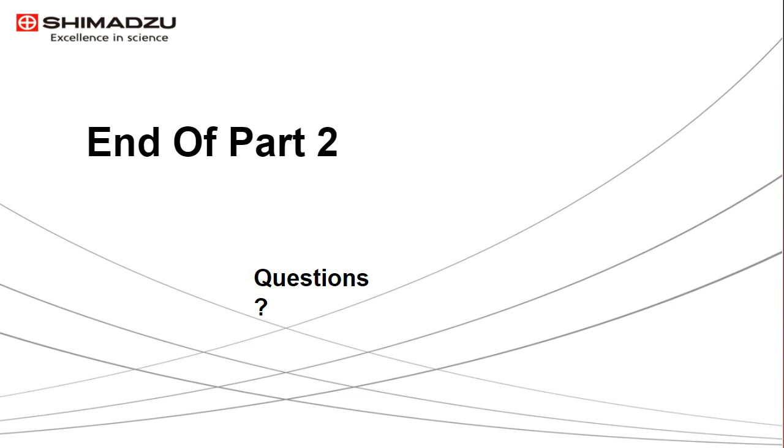The first question is, how is there chemical information contained in the scattered light from suspended particles? That's actually a really good question. In the world of spectroscopy, your interaction with the sample is all about path length. In a typical UV instrument, you've got a quartz cuvette, and you know the path length because it's the size of the cuvette. When you move to a diffuse reflectance measurement, you're still making a measurement that contains path length, but it's just a much smaller path length.